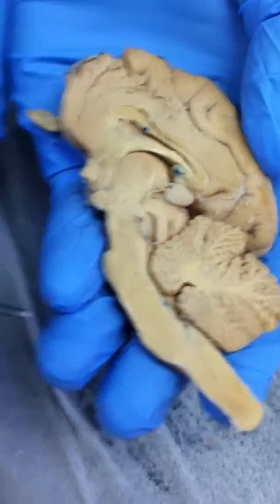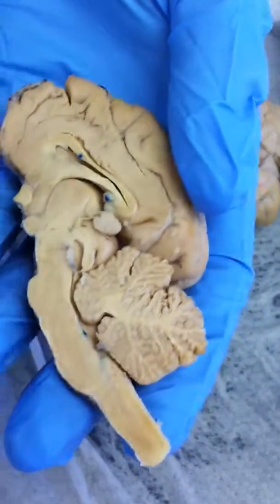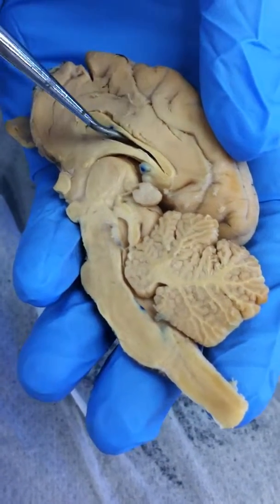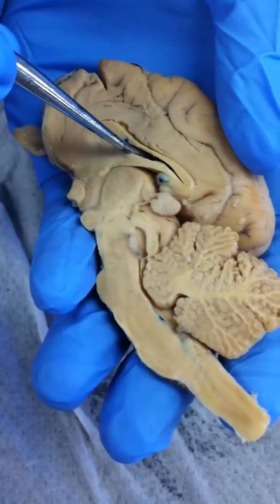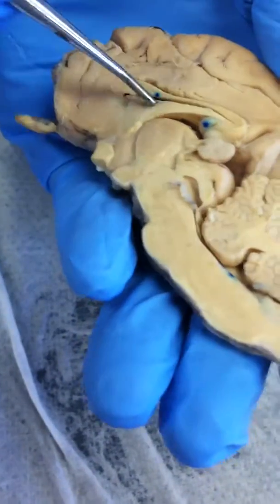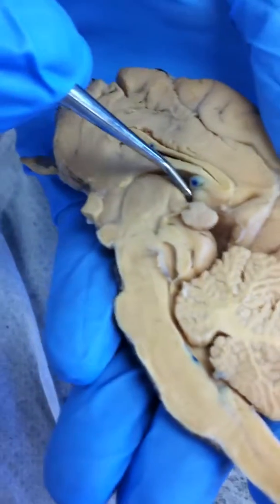And that's it. So then the path, you've got to know the pathway of the cerebrospinal fluid. It starts at the choroid plexus, where it's made in the lateral ventricle, the black thing. So lateral ventricle is the first. Then in the lateral ventricle, there's an interventricular foramina, which is a hole. Foramina means hole, which leads into the third ventricle. So it goes right into the third ventricle.